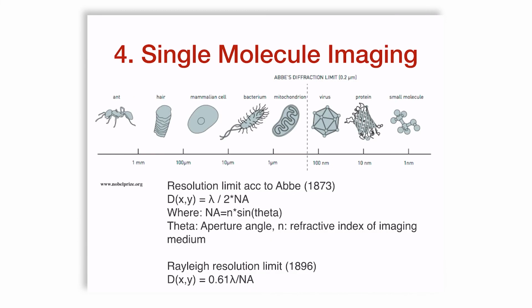Lastly, I want to touch on a method of microscopy that is referred to as single molecule imaging.